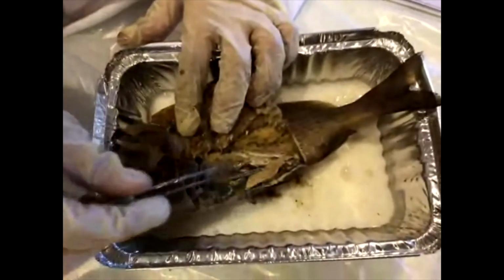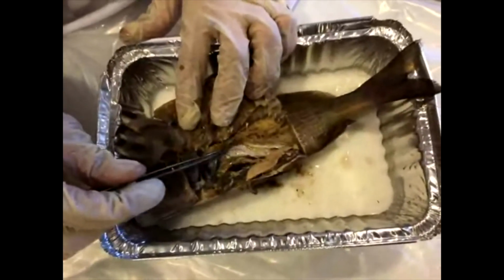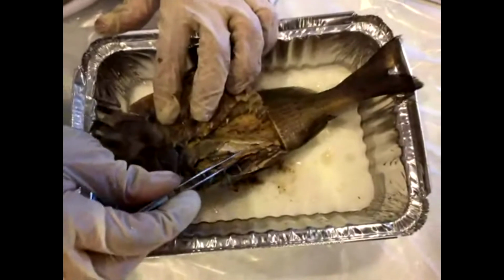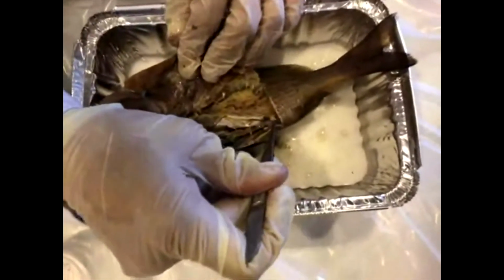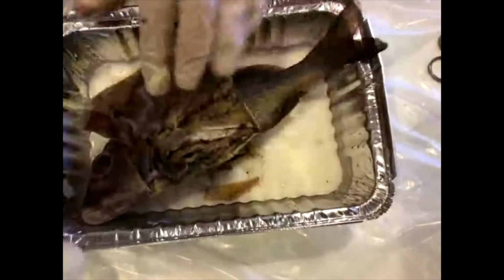Okay. So we just went through the digestive system. It starts with the liver making enzymes. That enzyme is put into the stomach where there's food, and then that food travels through the intestine where the nutrients are absorbed. And then once the food is just waste, it'll exit through the urogenital opening here, a multi-purpose exit for the fish.